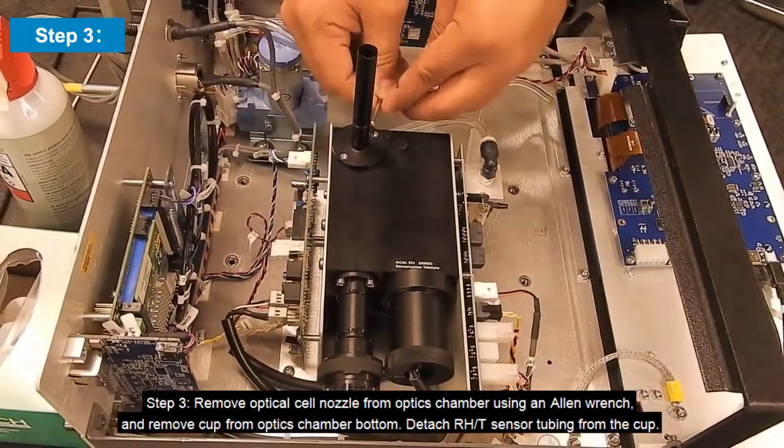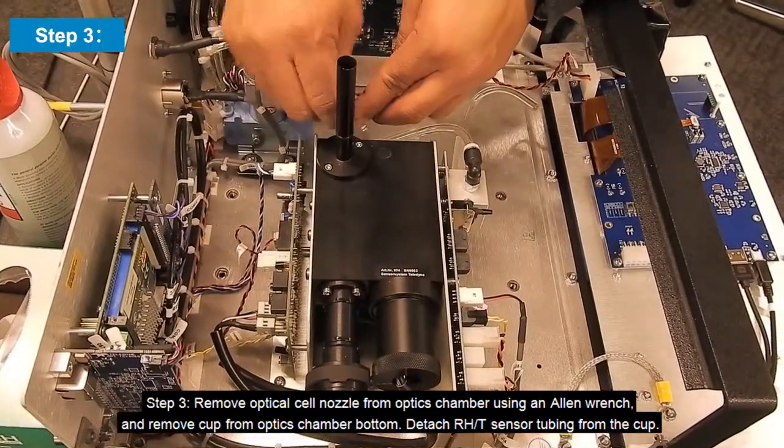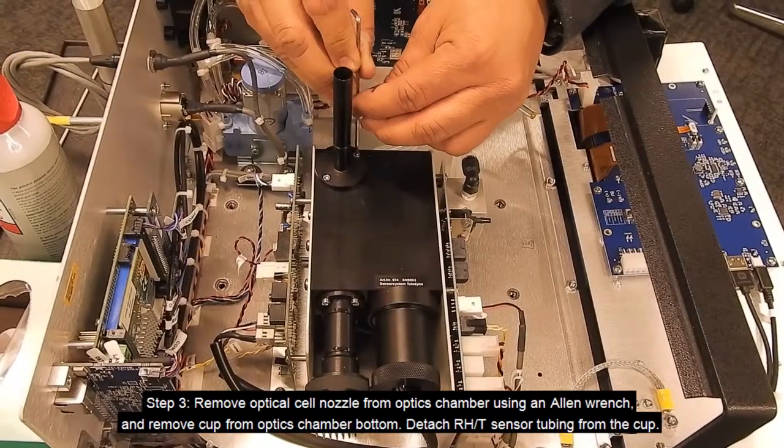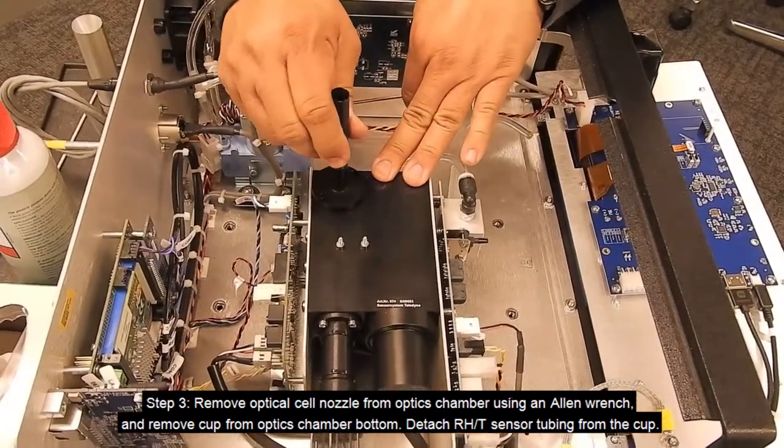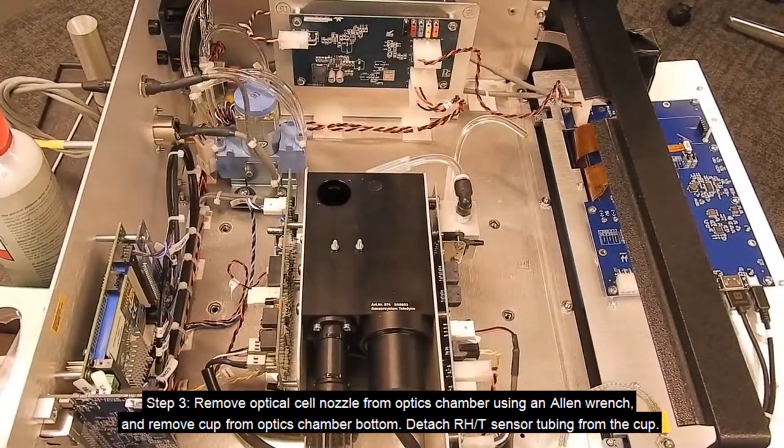Step 3: Remove the optical cell nozzle from the optics chamber using an Allen wrench, and detach the relative humidity and temperature sensor tubing from the cup.